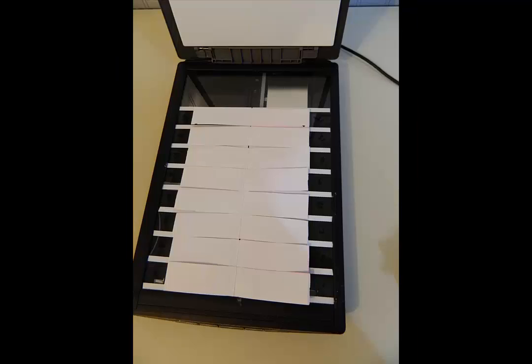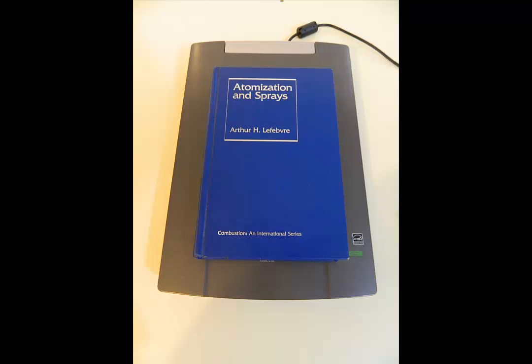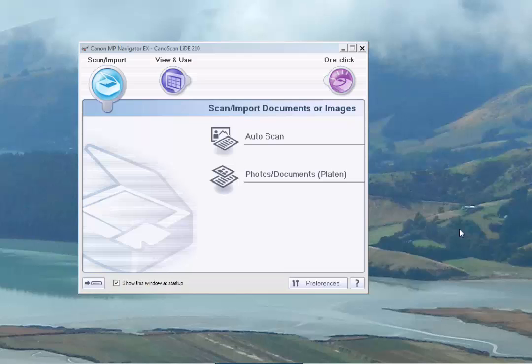Here you see we've taken some spray cards that are unfolded and they're loaded into the scanner. A quick little tip for loading the scanner is once you put the cover down on it, put a book on top of it to press those cards down good and tight. The flatter they are on the platen, the more precise the scan.